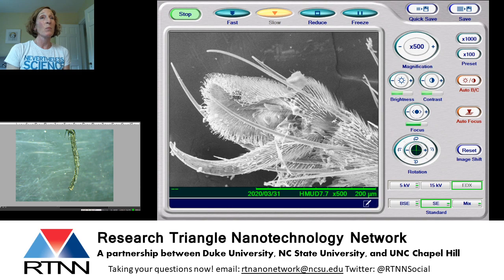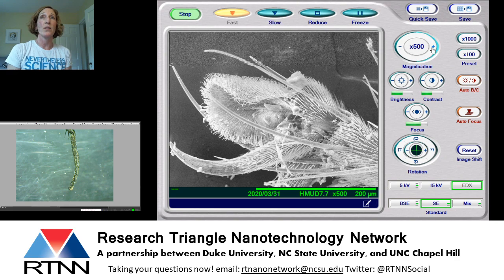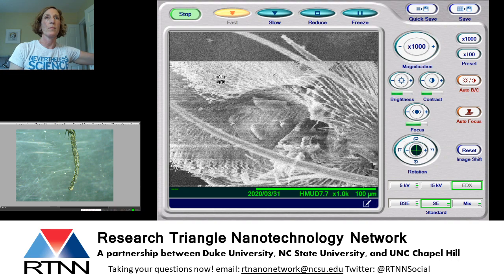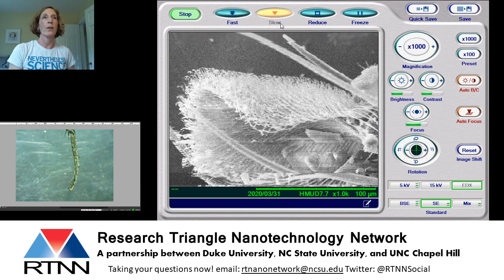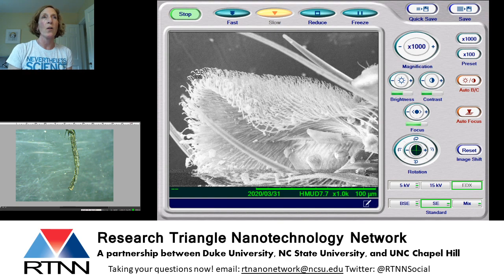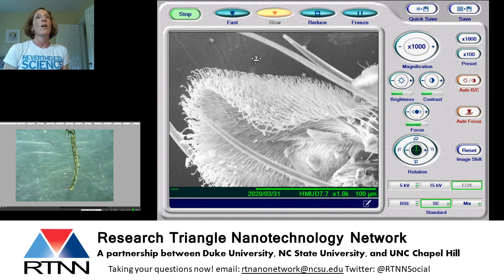So if we zoom in even more to this little flap, we're going to look especially closely at these little hairs. So let's zoom in some more. There we go, and I'm going to slow this down a little bit. And you guys see these little hairs? Do you see how they all have these little flat ends right there? Those little hairs and those little flat ends produce a little sticky substance made of sugar and oil. And apparently that little sticky substance on the end of those little hairs is what actually lets the fly walk on the ceiling.